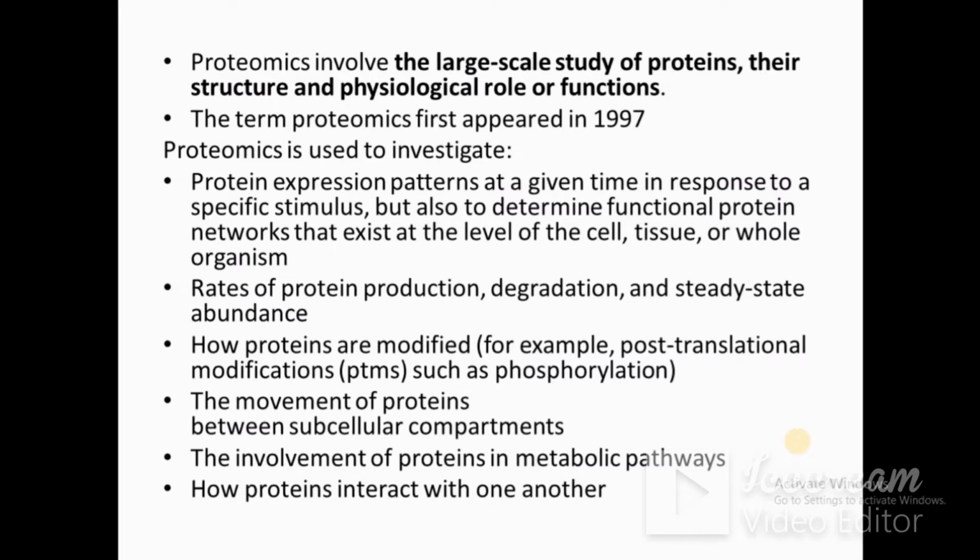How proteins interact with one another can also be understood through proteomics. By using bioinformatics for studying proteins, the tools can easily be used to identify the functions or any properties of the proteins, and all these investigations are done through proteomic tools.